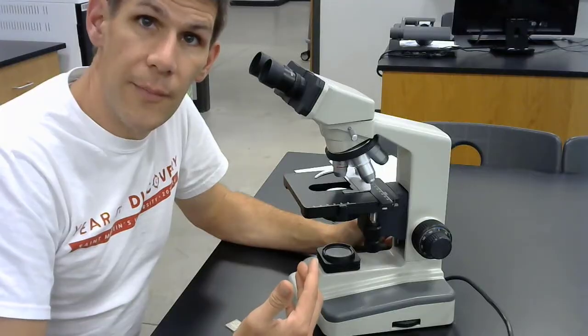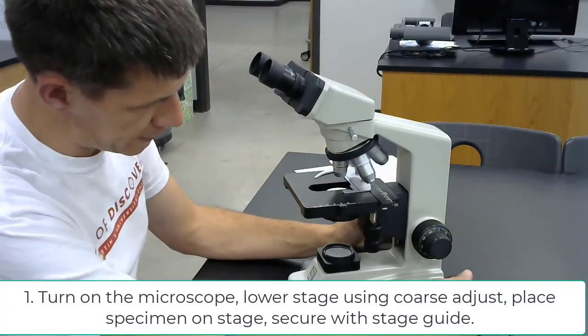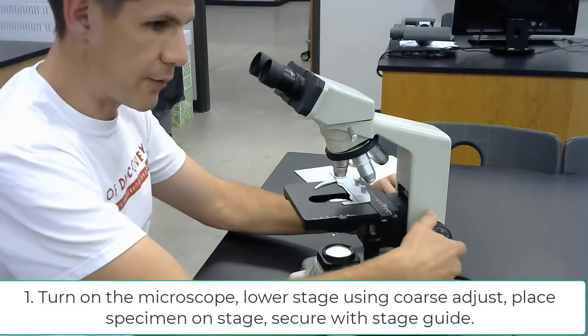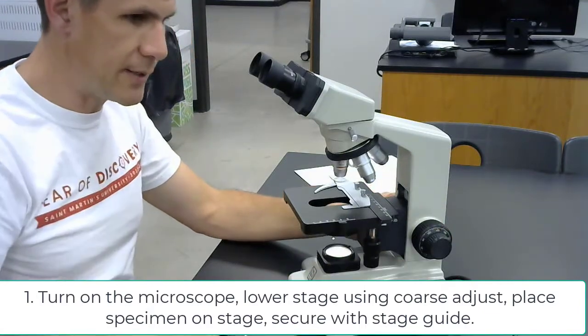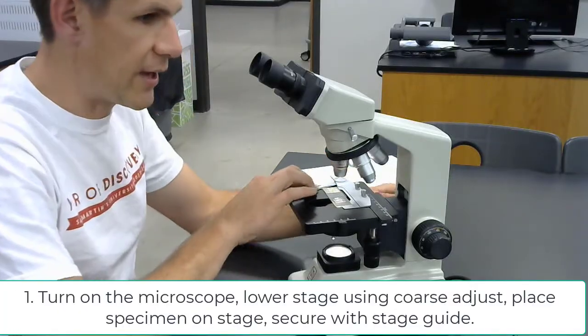So how would we look at something on the microscope? Well, first I'm going to turn on the microscope here in the back, and then I'm going to lower the stage using the coarse adjustment, and I'm going to put the specimen here and secure it using the stage guide.